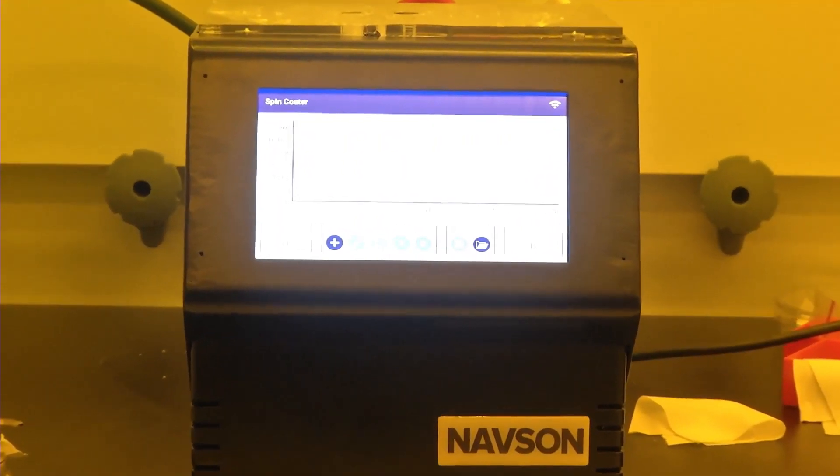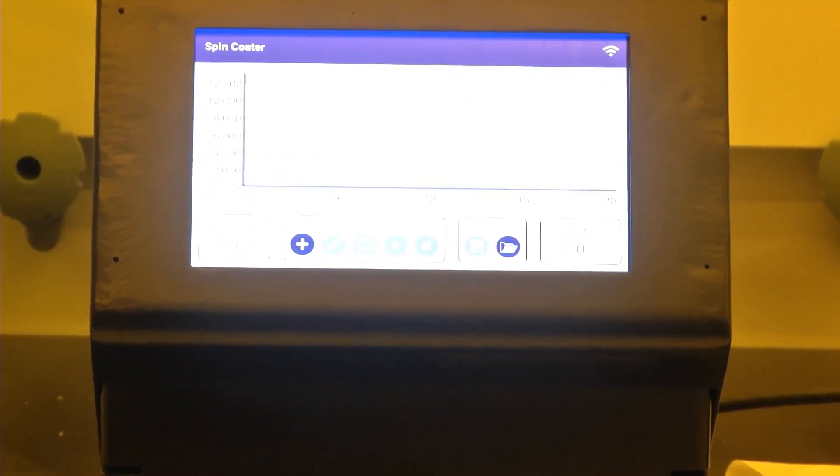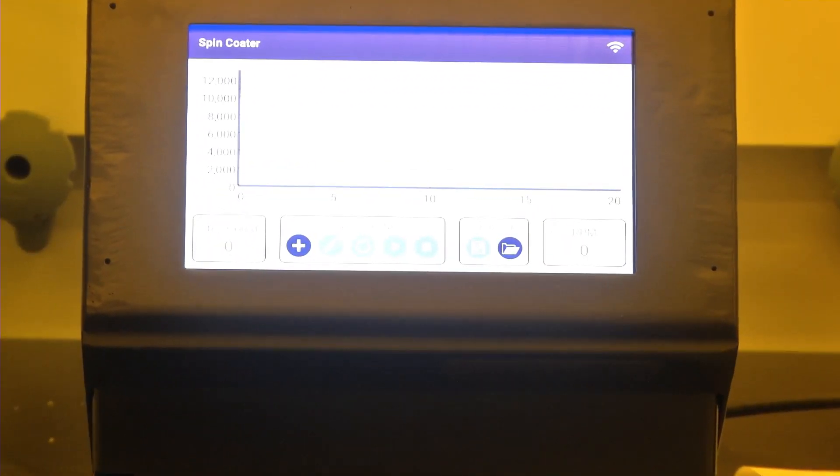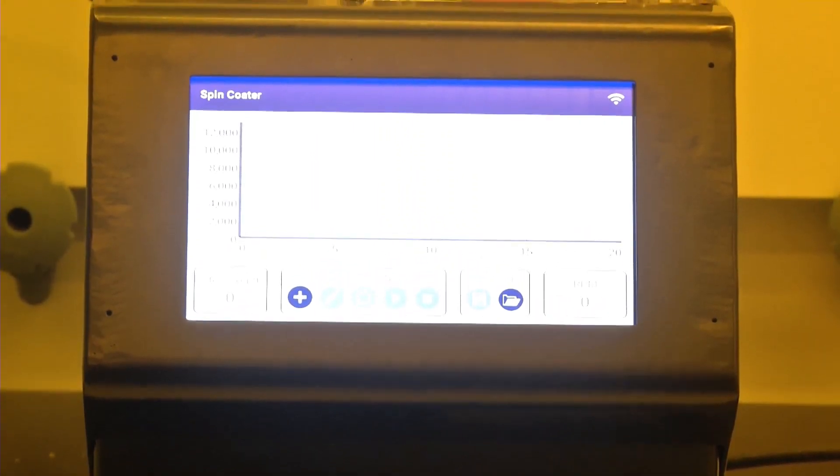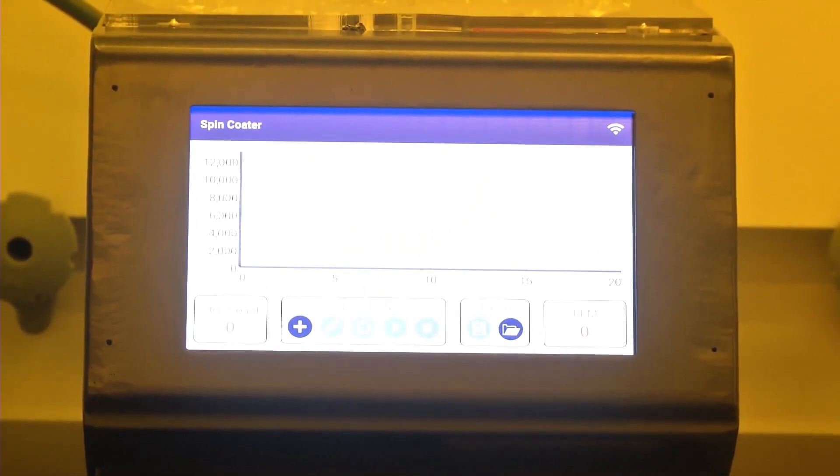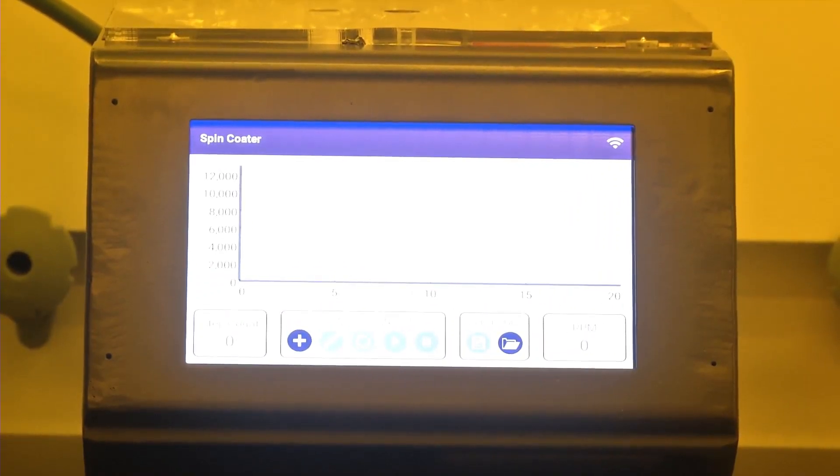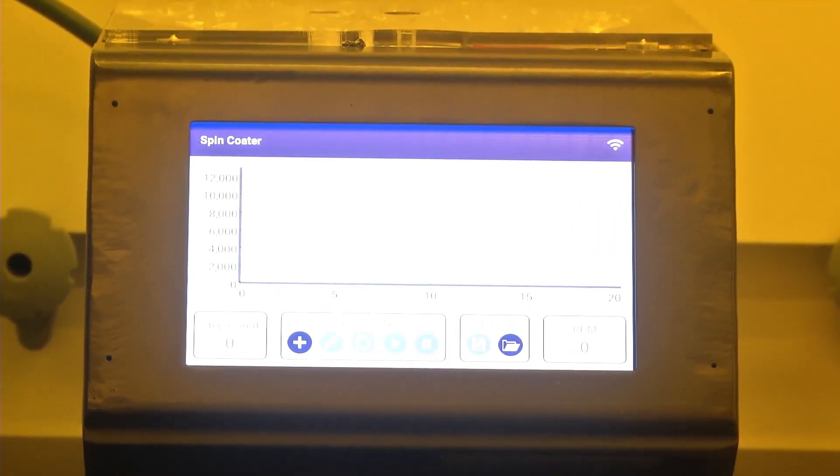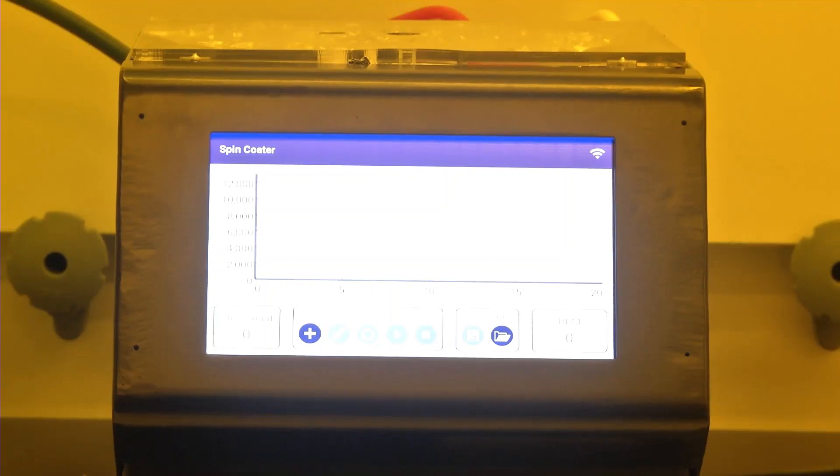The first step to spin coat any kind of photoresist or polymer is to use a spin coater. The spin coater works on the principle of centrifugal force. You keep the substrate on a sample holder, and the sample holder holds the sample by virtue of vacuum which is generated by a dedicated vacuum pump. Let us now see how a spin coater can be operated.